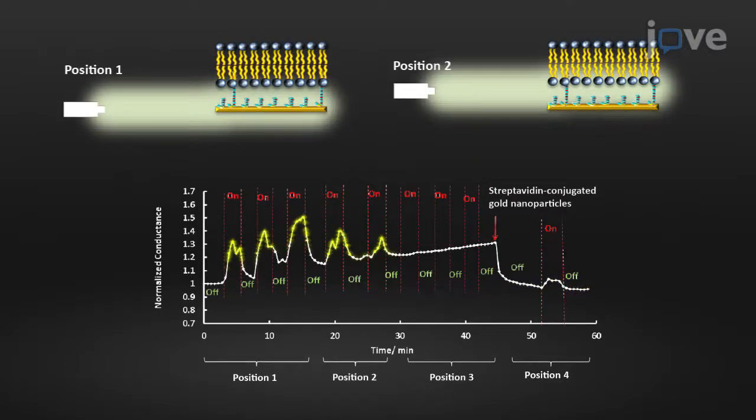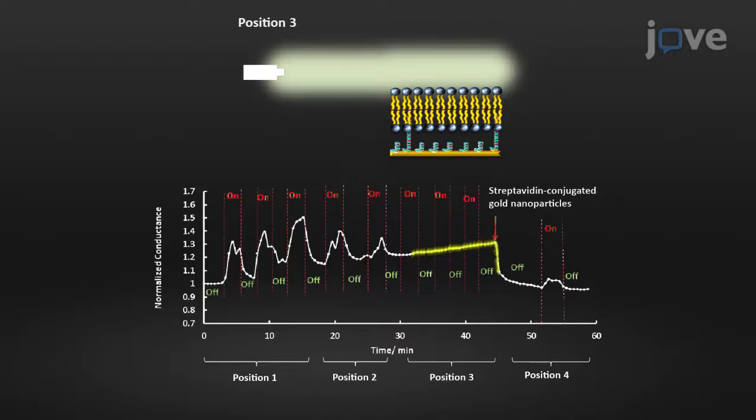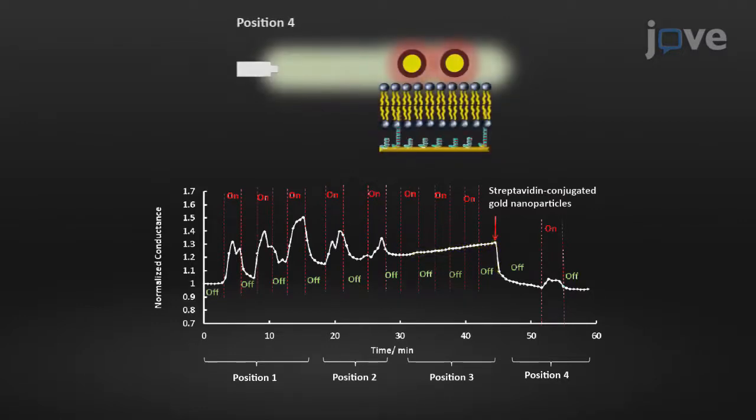This technique uses a biomimetic membrane system to observe and interrogate photothermal effects on a biological system, resulting from the heat generated due to the interaction of gold nanoparticles with light, by measuring the conductance and capacitance changes across the model cell membrane. The use of nanoparticles in photothermal therapy is showing great promise as potential cancer therapy. This method provides direct information on how this approach affects cells.